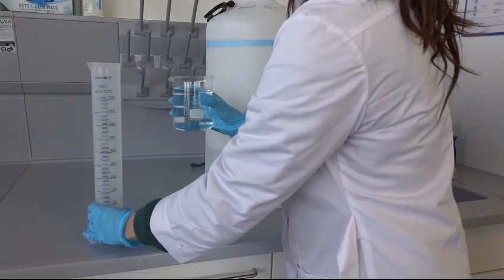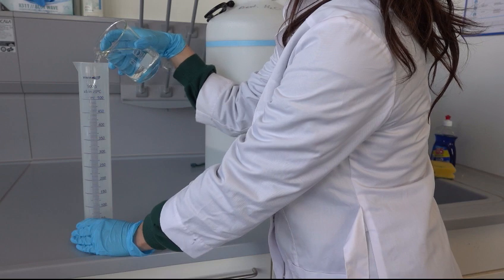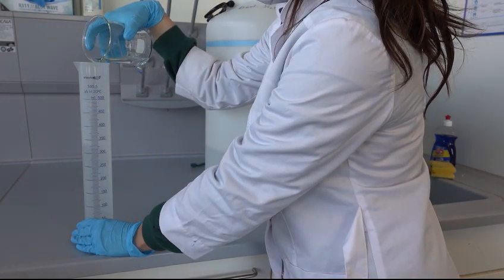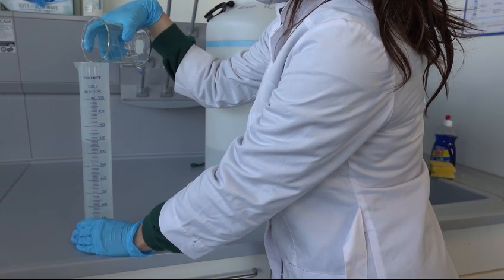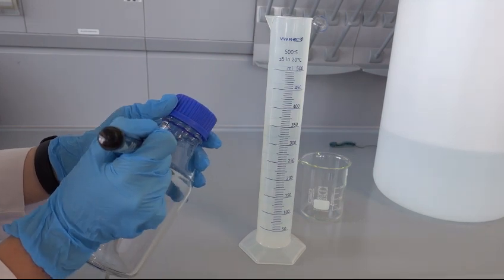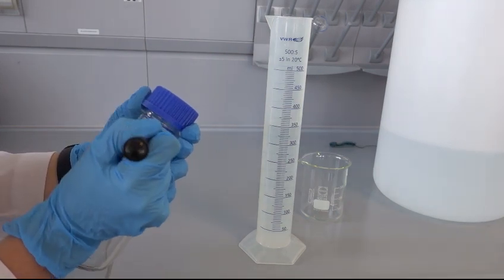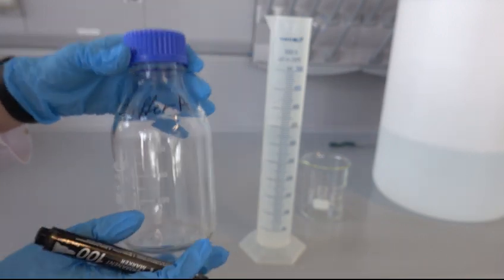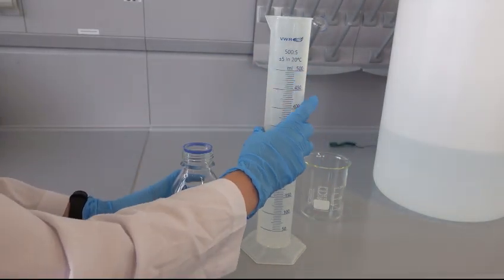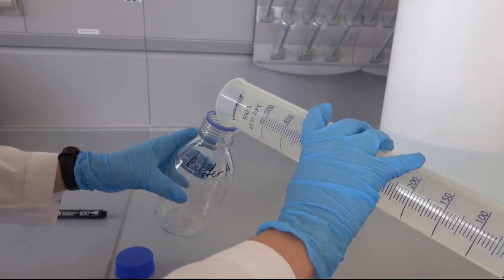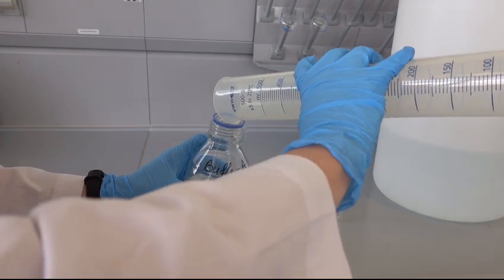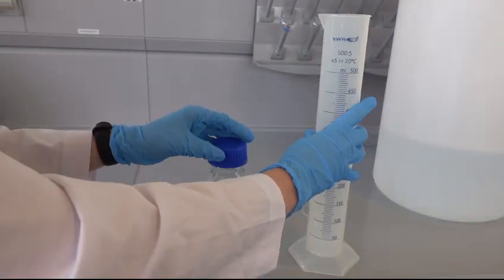Before adding the reactants, we are going to measure 350 ml of water and transfer it into a Duran bottle. Don't forget to label it before the preparation. The bottle is then transferred into the fume hood where the reactants will be added.